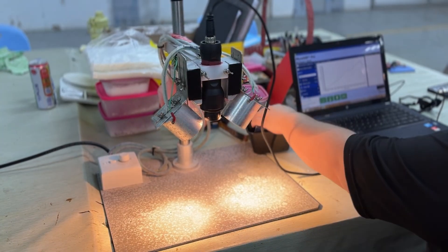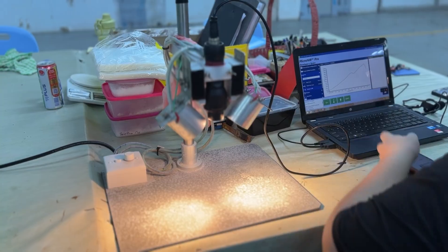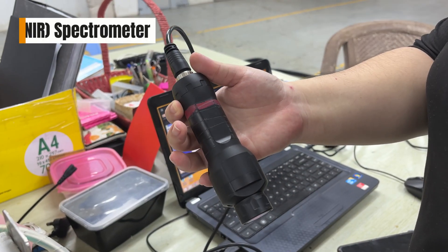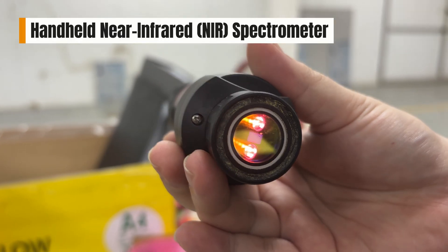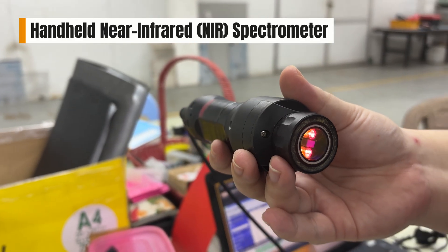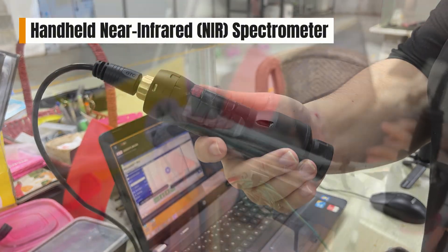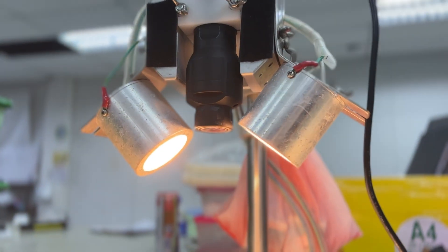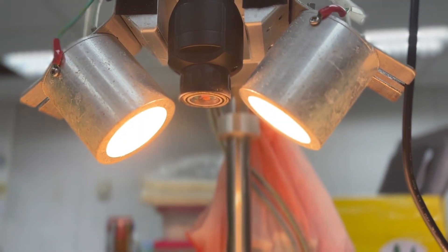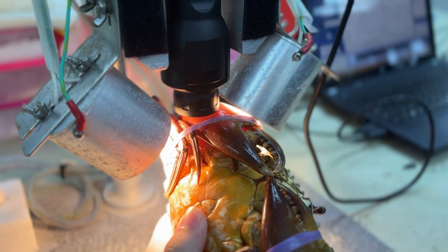Now we'll show you how this system works, step by step, to test and identify the quality of each crab. This is a handheld near-infrared spectrometer — a portable device that uses near-infrared light to quickly analyze the chemical composition of a sample without damaging it. This is the stand used to hold the spectrometer; it includes built-in lights on either side to provide consistent lighting during the scan, which helps improve accuracy and reduce interference from external light sources.